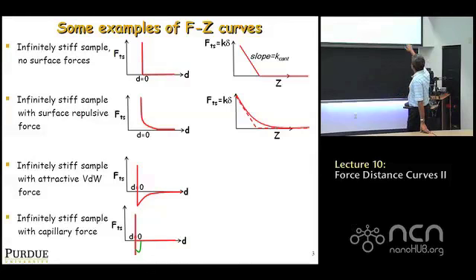So what is happening is, of course, when you're way over to the right, when Z is large enough, there's no interaction force because your gap is pretty high, right? Separation is pretty high. As you come close to the sample, you see there's a gentle increase in interaction force. There's a gentle curve that comes in. But at the end of the day, as you press down further, you will have to hit that vertical wall.